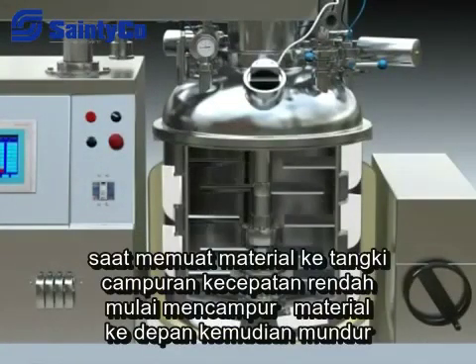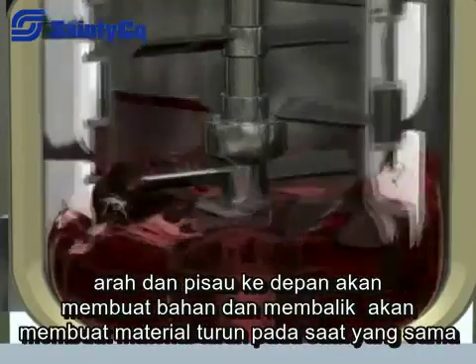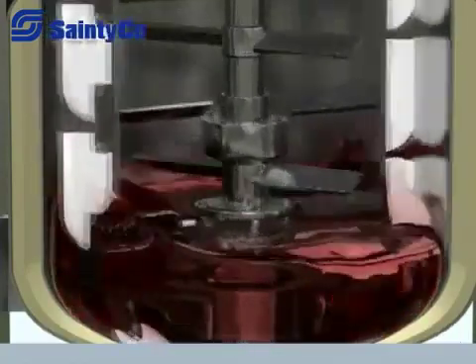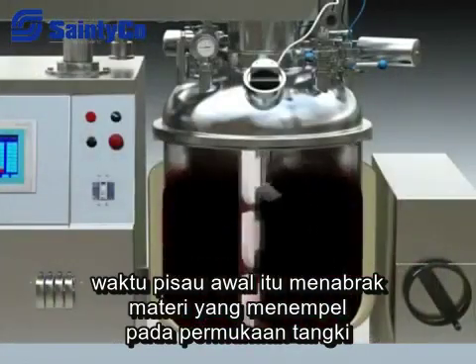When loading the material to the tank, the low-speed mixer starts mixing the material in forward and reverse directions. The forward blade makes the material move up and the reverse blade makes the material move down. At the same time, the scratch blade will scrape the material which sticks on the tank wall.